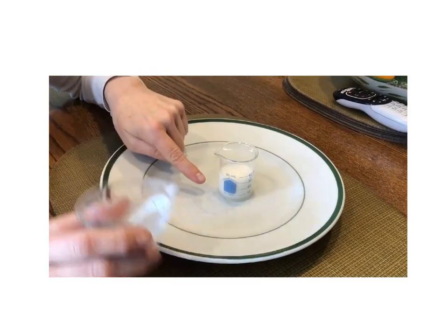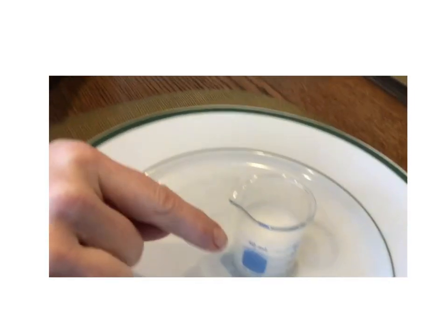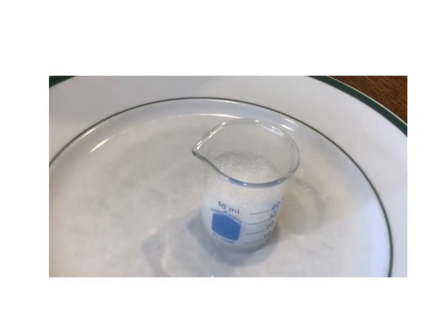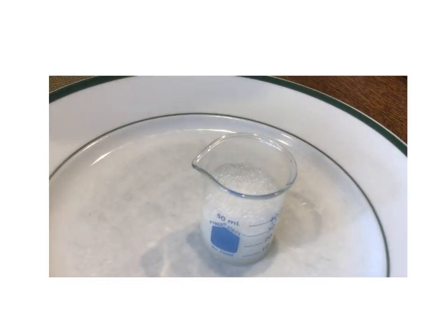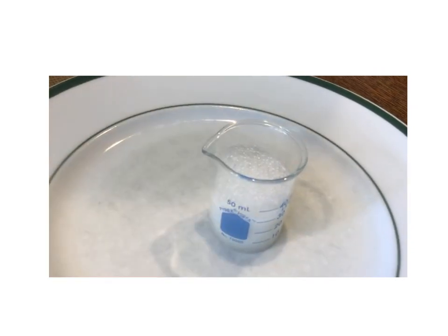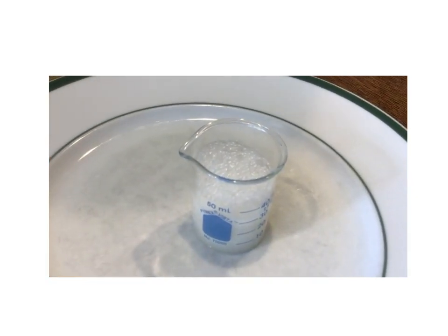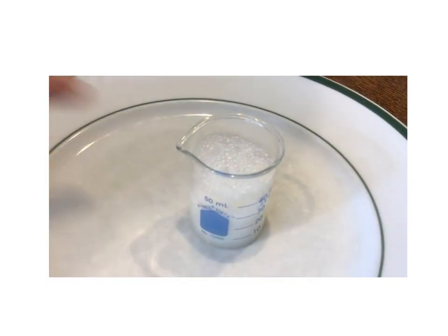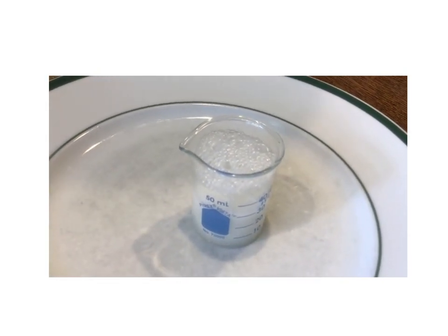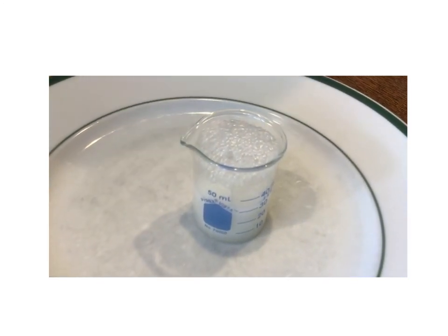And as you get closer, you can actually see all the bubbles, right? You can see all the bubbles. That's the oxygen coming off, and that's the oxygen that would be going into the balloon. And once that oxygen is in the balloon, then we would measure how much is produced. And you can see that the longer it sits there, the higher the bubbles go. We could have actually measured the height of the bubbles after a certain amount of time. That also would have helped us. There are all kinds of different ways of measuring this reaction, but we're going to be using the lab that uses the balloons.